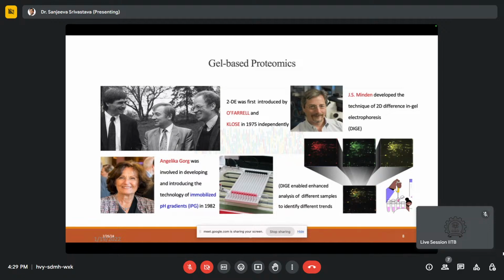If you're looking at, let's say, a complex mixture from a pull-down assay, a complex which is biologically very interesting to you, and now you want to further study that, if you separate them on the 2D gel, you can get all the different proteins in the mixture well separated, and now you can excise those spots. Or in this case, where I'm talking about bacterial proteomics, when you're looking at drug treatment, one is untreated, one is treated. You run them on separate gels.